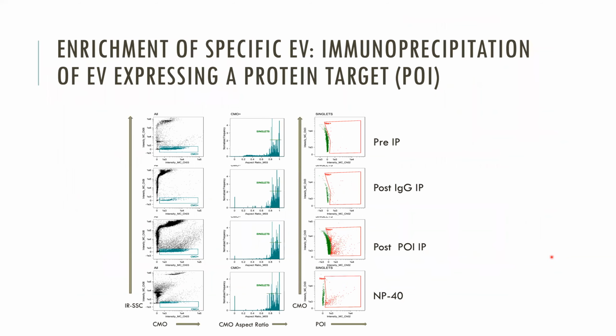So interestingly, we were able to enrich specific EVs based on an immunoprecipitation. This is a study that was done by a great student who has recently left MD Anderson, and he was developing an IP method for these.